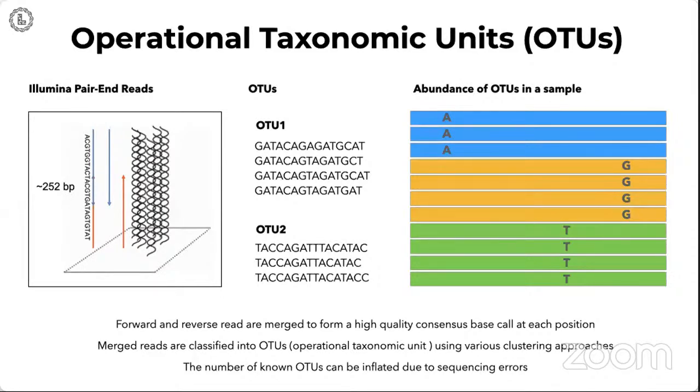All right. So they can be clustered using general clustering approaches that will cluster these reads based on the percentage identity level that we define while defining the taxonomic units that we want to characterize. So we were discussing that these taxonomic units are actually taxonomic organization in terms of kingdom, phylum, class, genus, etc. So these OTUs are the ones that are identified as specific species or genus or phyla of bacteria, and they are the ones that will get characterized or quantified among the different samples that we have.